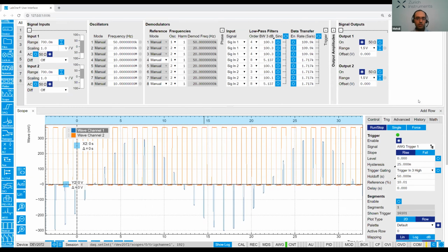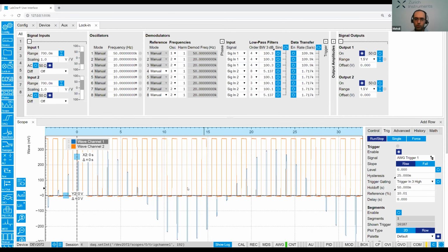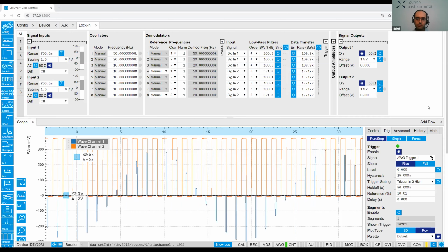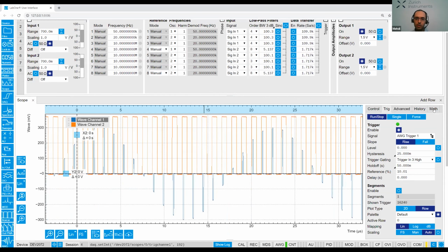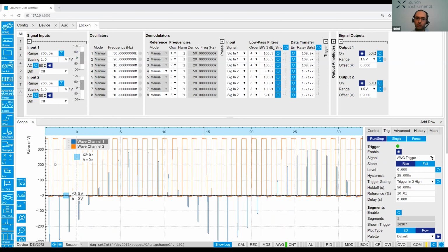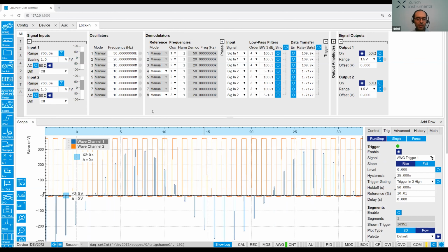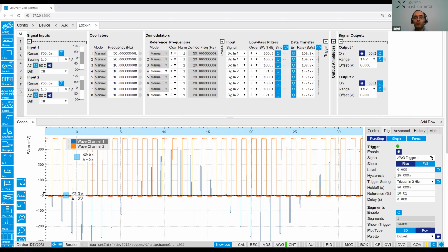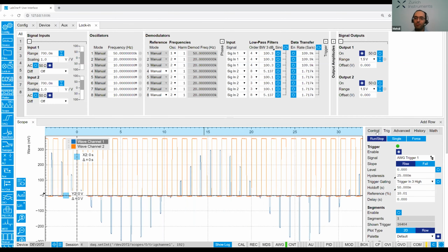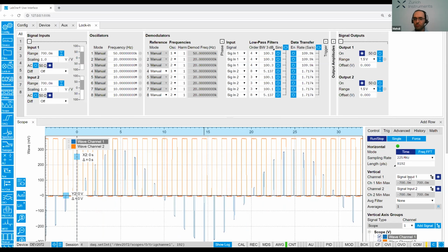So that's the generation part. Now what do we want to measure? Ideally you need to measure at the resonance frequency of your cantilever, but I don't have a cantilever here to apply these things. What I can do is to lock to the pump and measure the probe with respect to the pump.